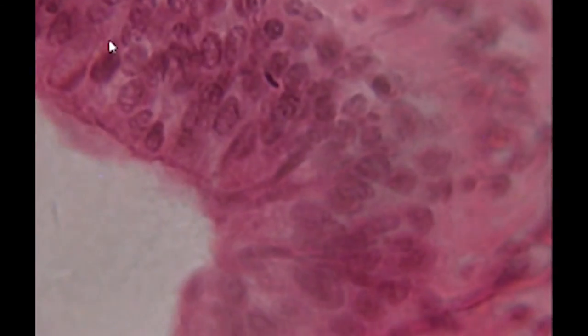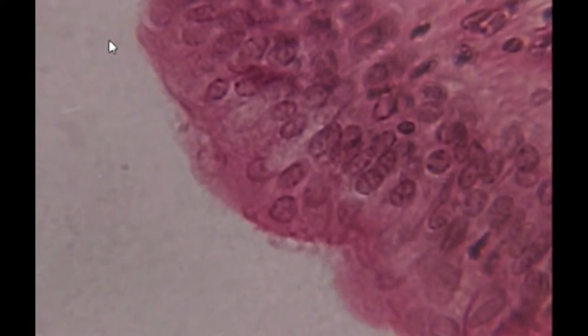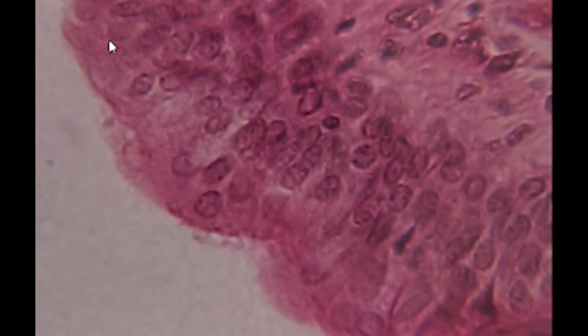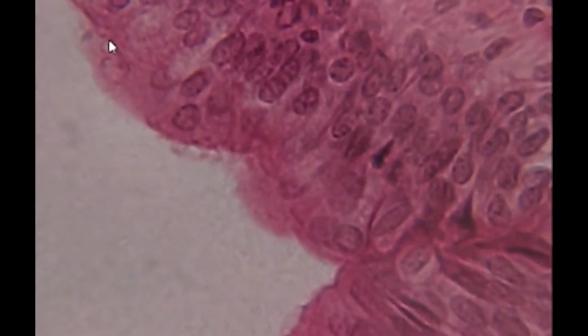I also want to find a spot that shows the cilia really nicely. Let's look at this spot. In particular, I want you to notice the cilia. The cilia are right here.